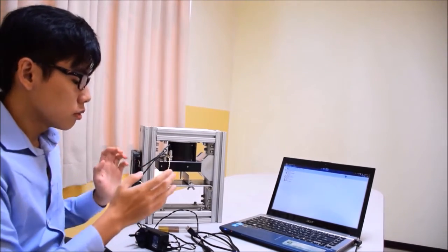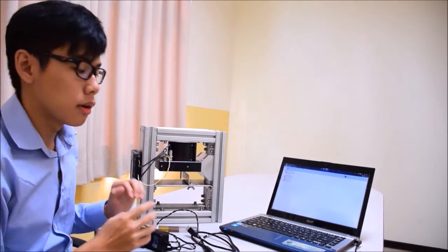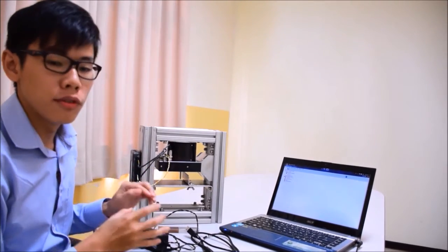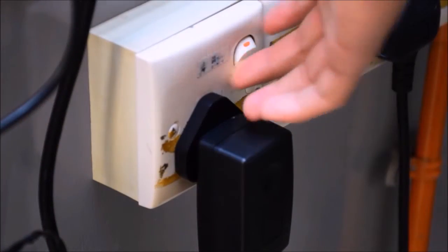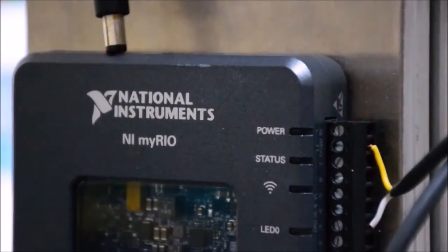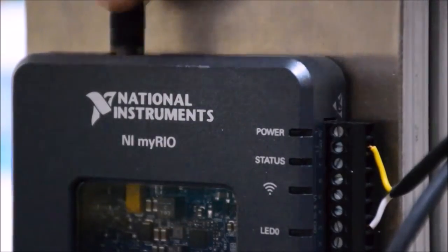To run this unit will require a few simple materials such as a power supply. Power the National Instrument MyRIO by plugging it in.